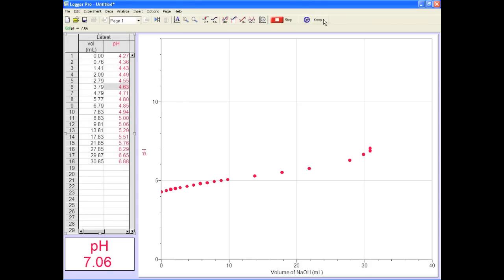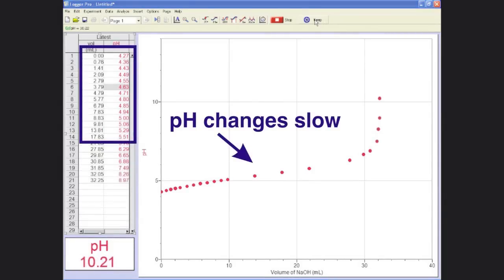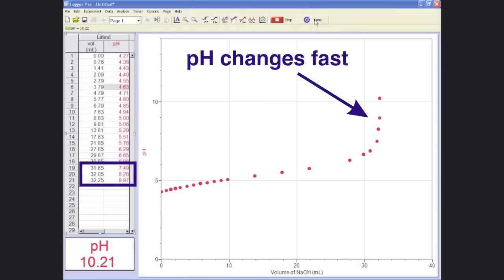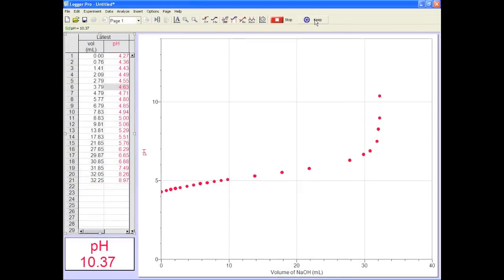Keep entering data and keep an eye on the curve. At some point it'll start going nuts and you'll have to slow way down when adding titrant. Try single drops or even half drops. Getting the steep points shows pro technique and gets you sweet results.